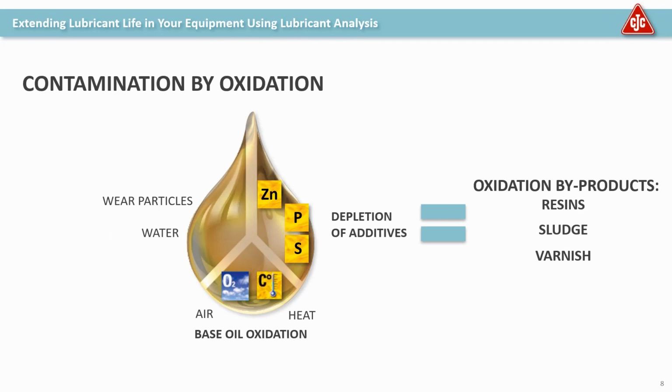As you mentioned, the wind turbine, if you're just taking a sample once a year or twice a year, in between those samples, this can increase. And then the result, of course, is that you have these oxidation byproducts, resin, sludge, and varnish. And so when we use other tests that we've discussed, then it gives us a complete picture that maybe the ISO code alone isn't telling us, and it can help us to identify the early onset of degradation or other problems that can really help us address those and then get that longer life that we're striving for.